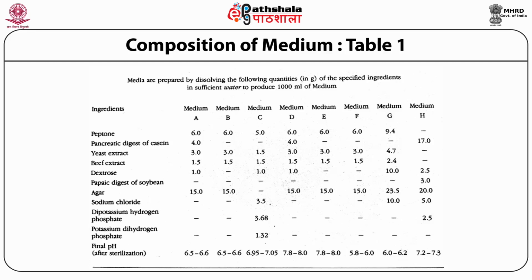Whereas the composition of medium B is different from medium A, and similarly medium C has a different composition, different ingredients, whereas medium D has some other components, and medium E has other components. It depends upon what type of antibiotic and what type of procedures we follow in the assay, or as mentioned, the media components are used as per the pharmacopoeial rule.